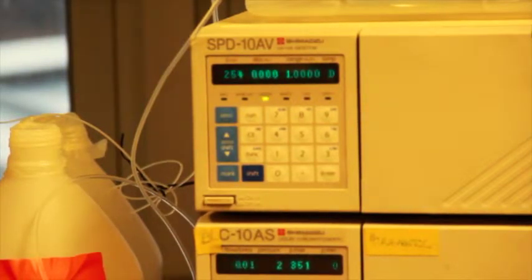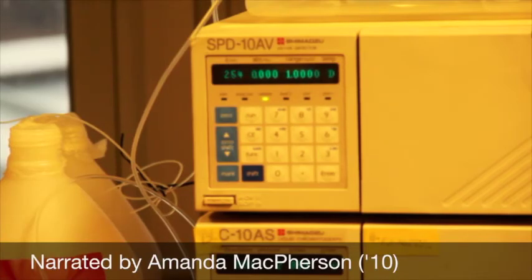And your flow rate should be 0.01 on your pumps. As long as your pumps say that, you are good to go. The last thing to remember is to make sure that you turn off the detector and the column oven at the end of the day. Good luck and have fun!